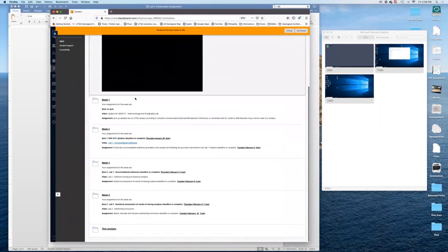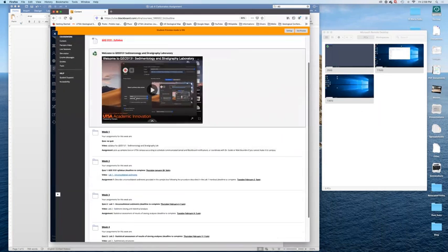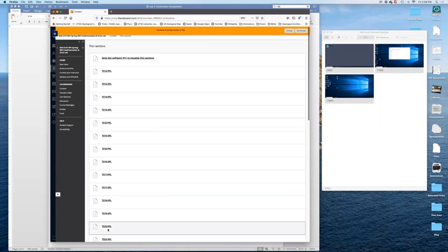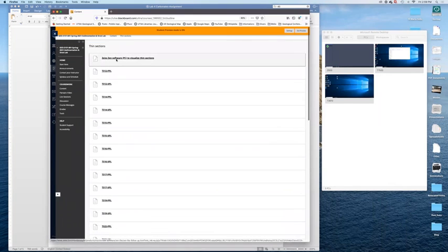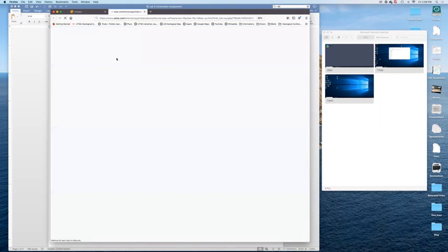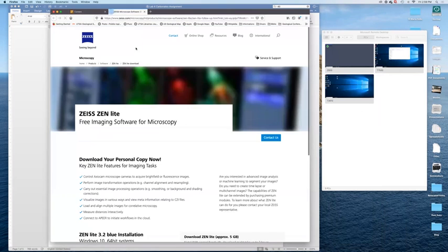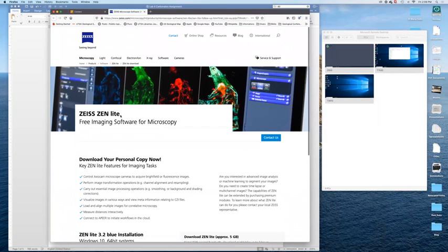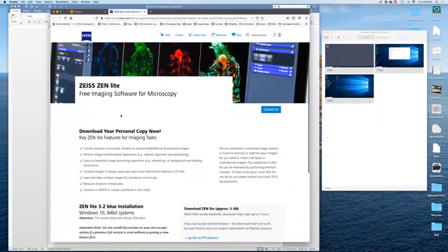If you go into Blackboard, so this is the opening window of your Blackboard. In content, there is now a folder that I would probably move at the top, that is called thin sections. You go in there and at the top, you have a link that is taking you to the Zeiss Zen Lit website.